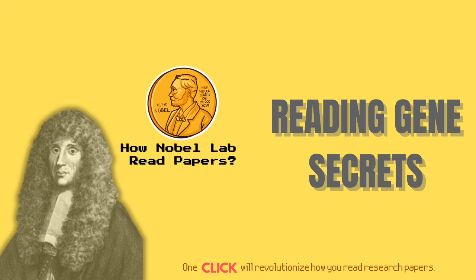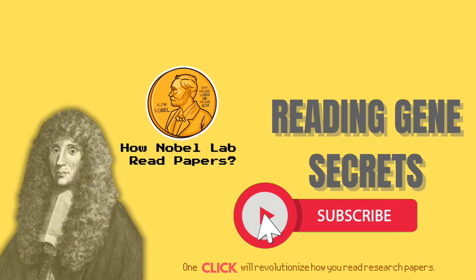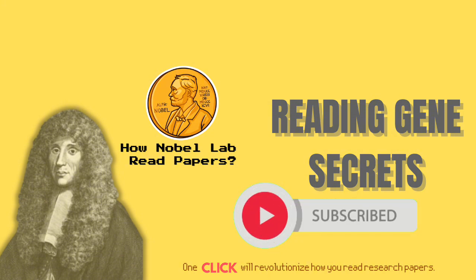Okay, I see the problem space clearly now. So, knowing all that, how did RNA-Seq actually step in? How did it offer such a different approach? Well, the core idea behind RNA-Seq is, I think, quite elegant. It's basically a digital measure of genes, completely different from those older analog methods based on how strongly something sticks to a probe. With RNA-Seq, you directly sequence fragments of the RNA after converting them to cDNA. You're literally counting molecules. Counting, not just measuring signal strength, like going from fuzzy radio to crisp digital audio.